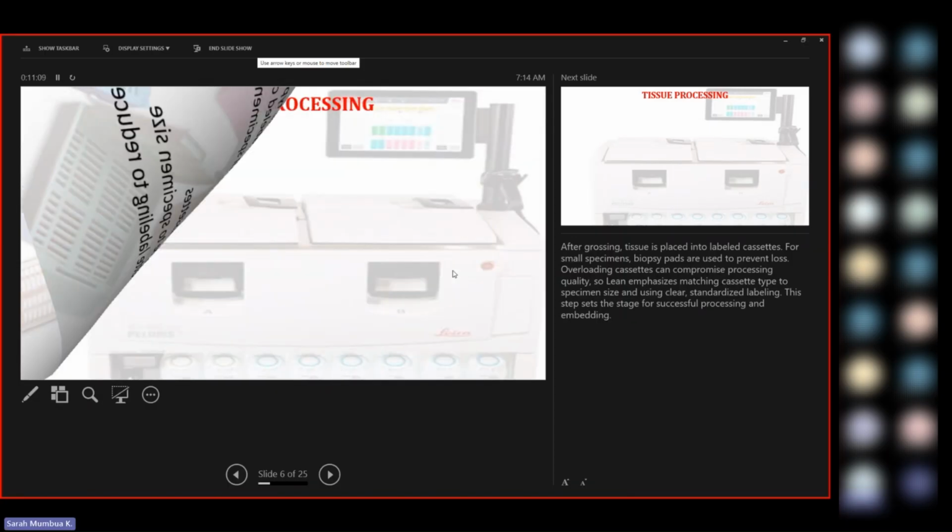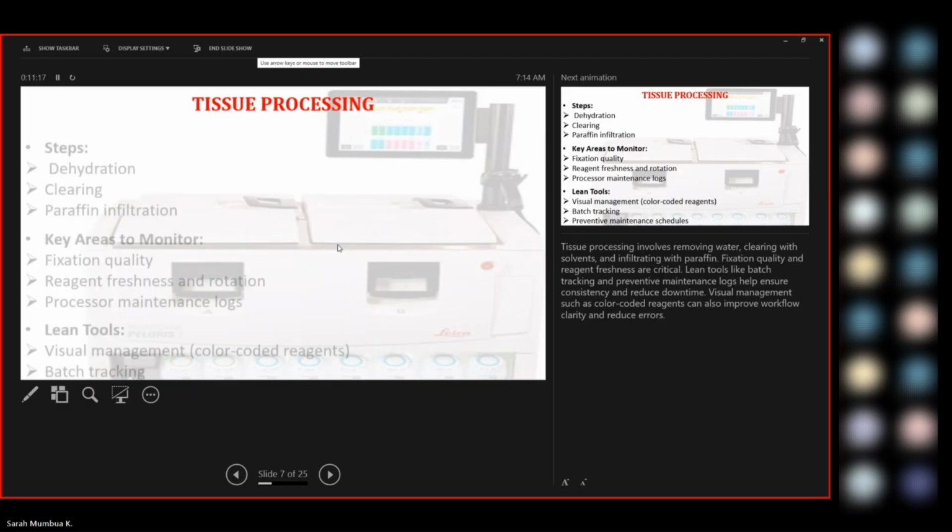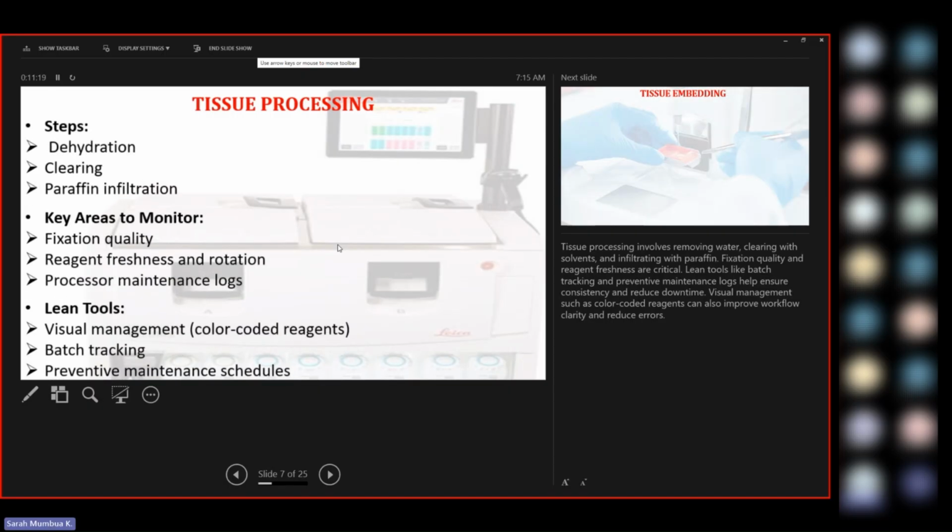Then onto our next step, which is now the main thing. Here we are going to do the actual tissue processing. These tissues, they are flesh. It's a tissue collected from the human body, so it's made up of water. The formalin, also the 10%, we are making the 10% buffered formalin. I'm assuming everyone is aware of how to make them.